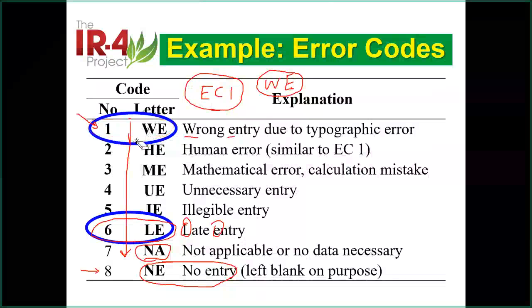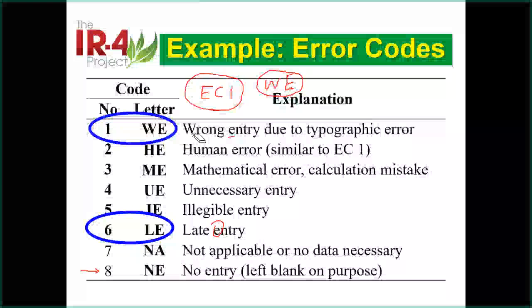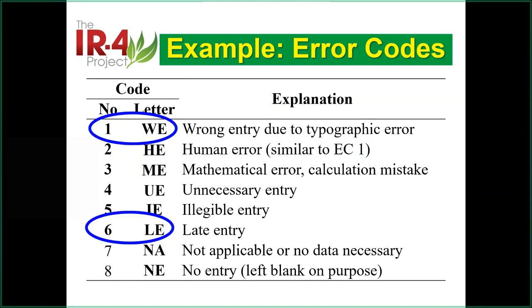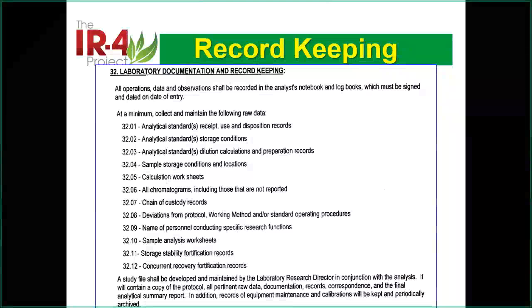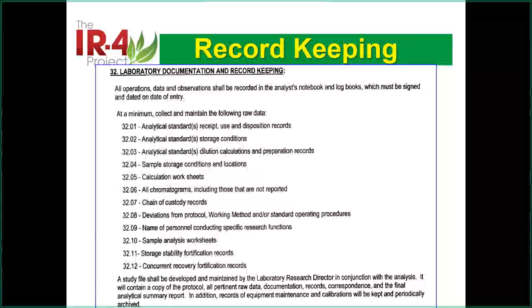I'm quite sure. Okay, so then we can talk about the requirements from the protocol. What the protocol requires to keep in the record, and you can read that. Of course, this is very small, and you can read any IR4 protocol. It should be very similar. For example, the lab documentation keep, okay, let me just quickly read that.